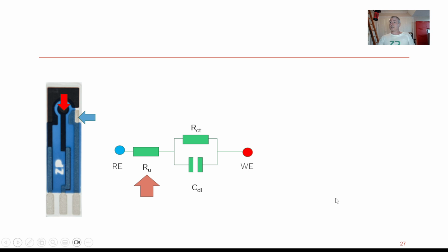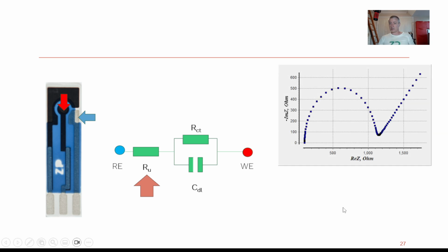So let's say I did some EIS. This is a simulation that I actually ran. It's a simulation, not an actual experiment. If you're not familiar with electrochemical impedance spectroscopy, maybe I'll link to the video that we have online about this. I do get some nice reviews on that video, with people saying it's quite easy to follow.